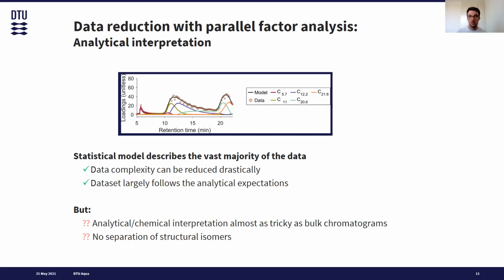It's also really interesting that such a large and complex data set, with such fragile measurement techniques like online couplings of high-resolution mass spectrometry, largely seems to follow the analytical principles. So things like matrix effects may not be as important as thought previously.